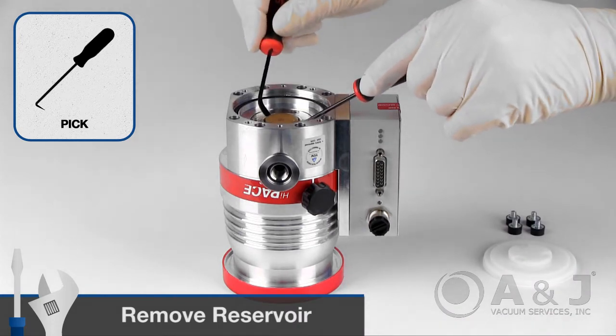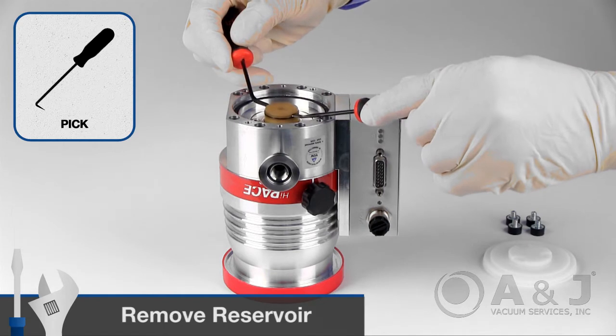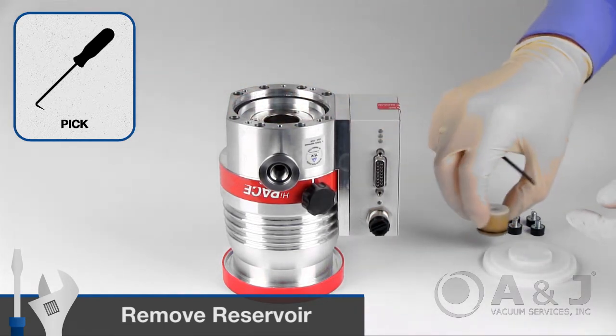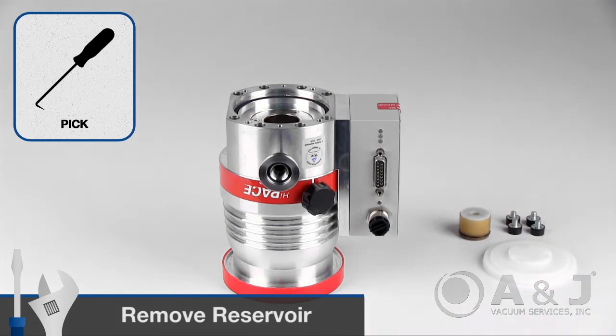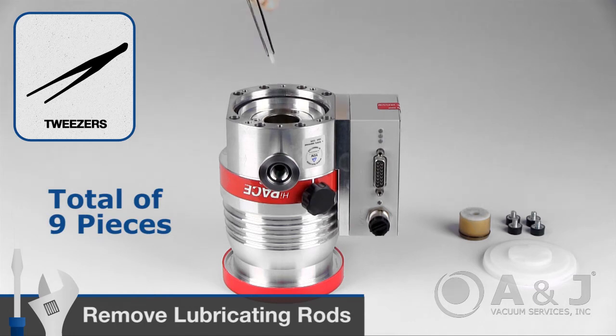Lift out the operating fluid reservoir using two screwdrivers or similar tools. Using a pair of tweezers, remove all nine used lubricating rods.